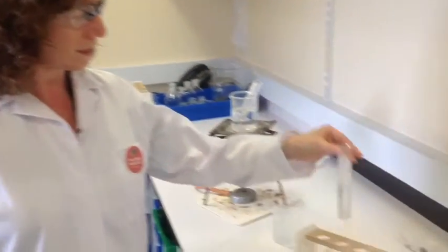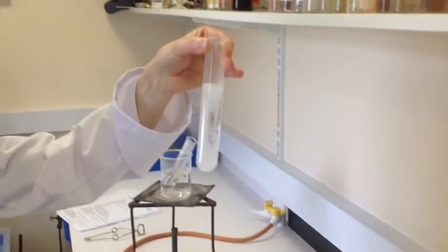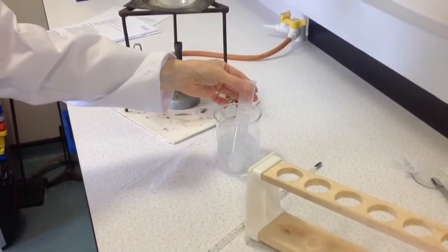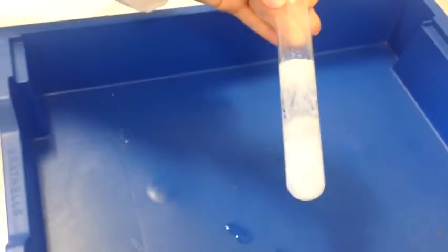We have now got our crystals forming, as you can see — beautiful crystals. To finish off the crystallization process I am just going to pop them in a beaker of ice water and leave it for a while. The crystals have now been cooling for a while — if I hold them over this tray you can see them. They are quite beautiful.